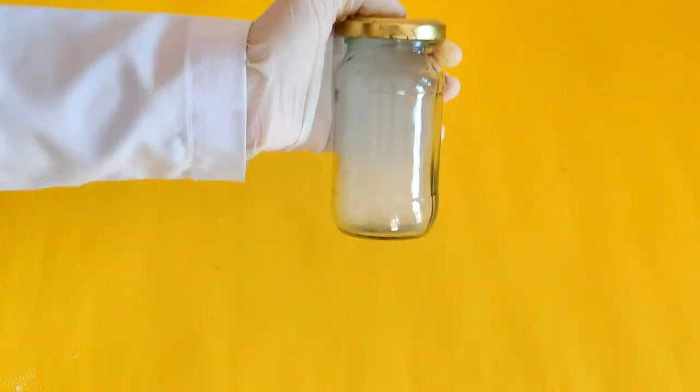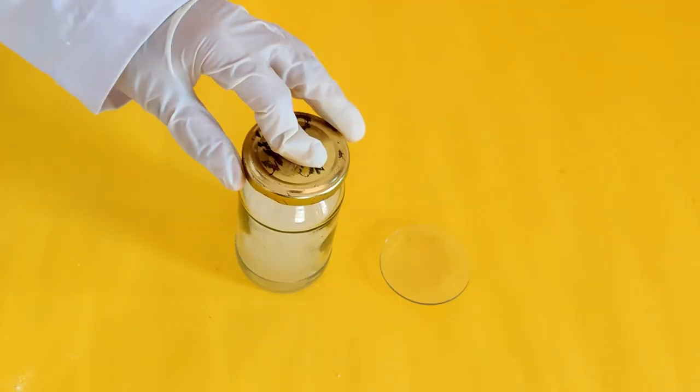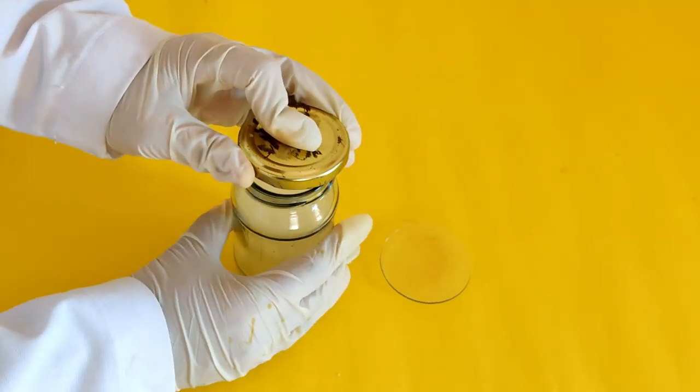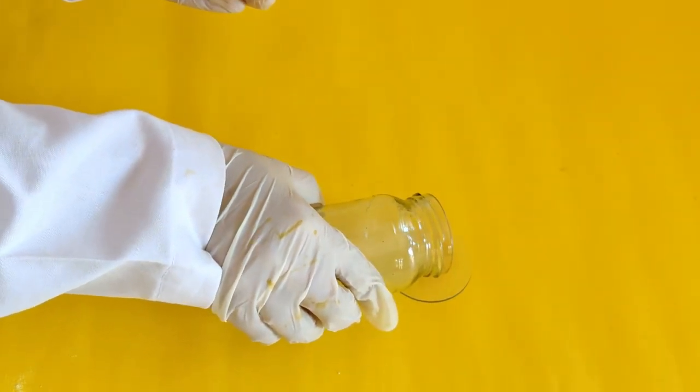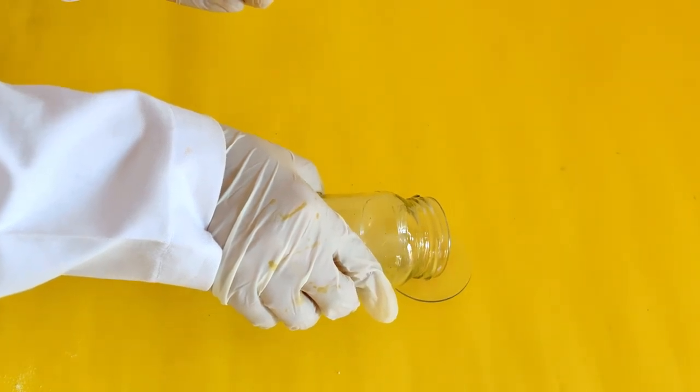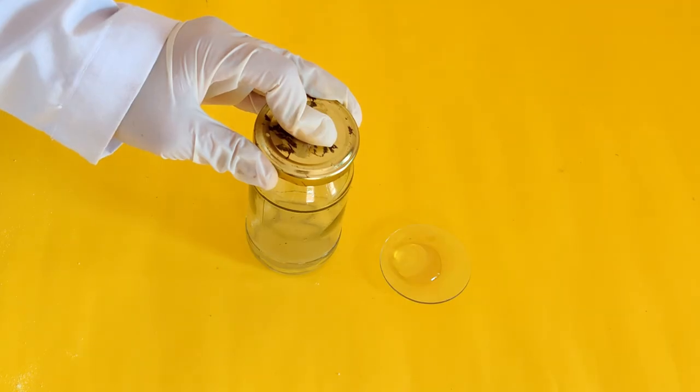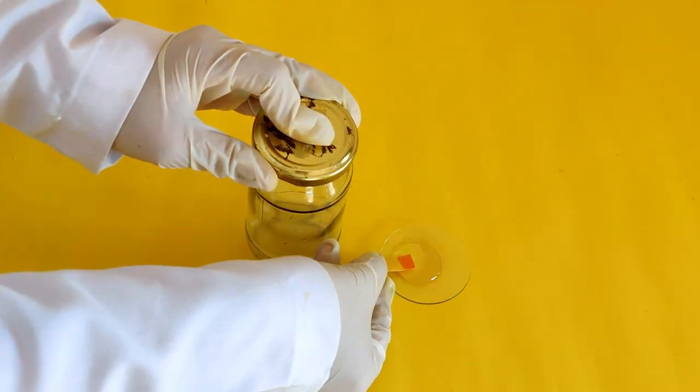Shake the glass jar so that the gas mixes with the water in it. Now, empty the content of the glass jar into the watch glass. Dip the pH paper in the watch glass and observe the change in its color.